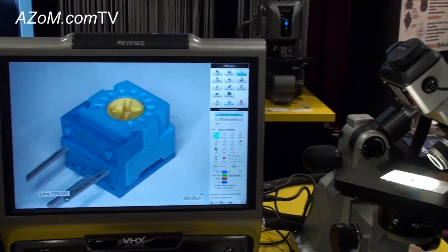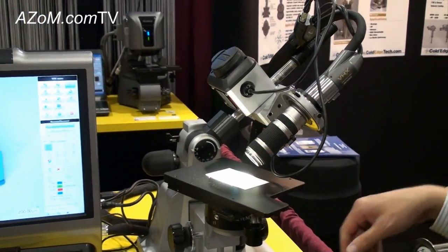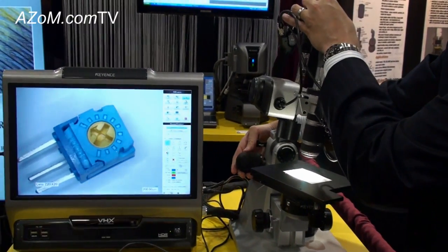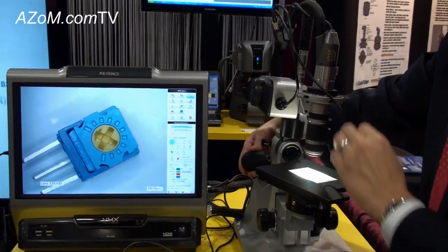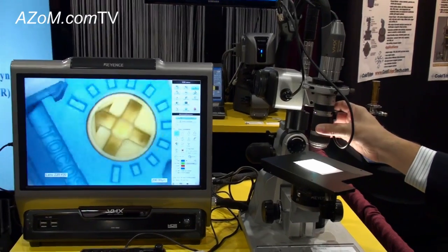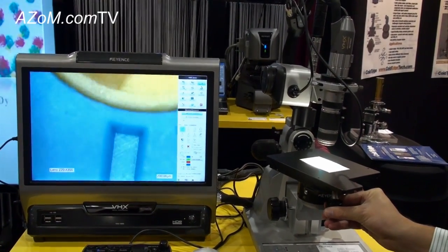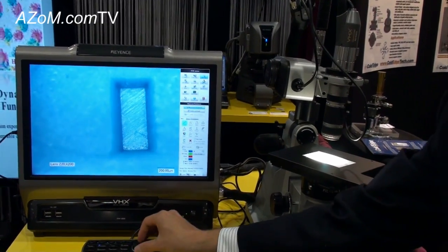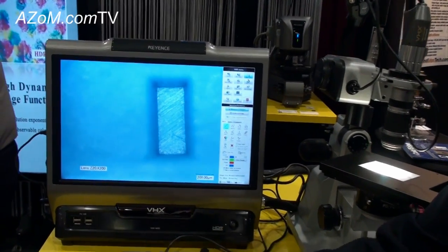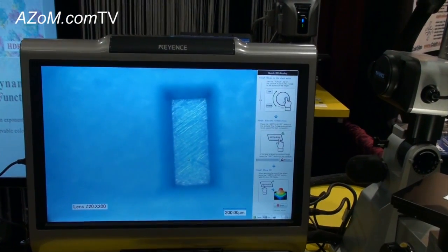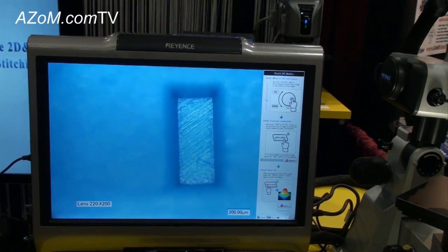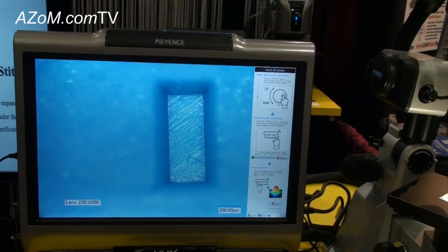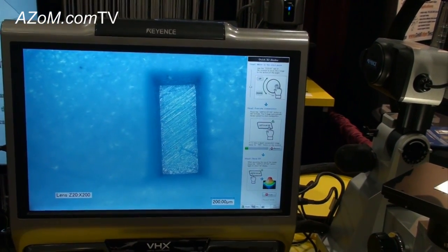Now if you need greater depth of field than what we're providing on the screen, we can improve that depth of field through software. I'm going to zoom into this small notch here — you can see either the bottom surface or the top surface. But I'm going to bring everything within the field of view completely into focus. What it's doing right now is stepping through multiple planes of focus and dynamically acquiring the pixels to build an all-in-focus image.